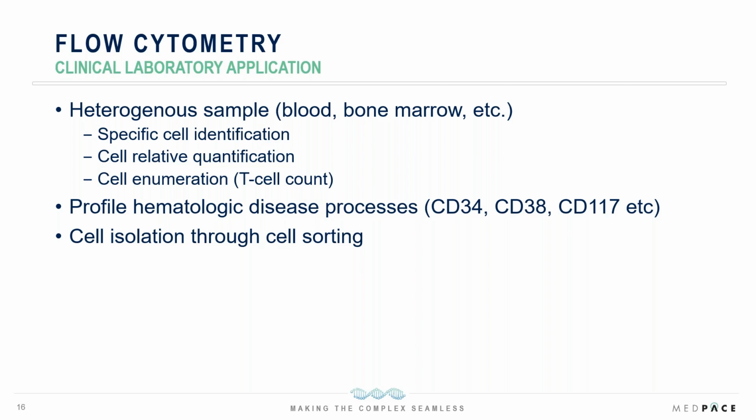And flow cytometry is a technology that has been in the making for some 40 years. In the start, you had one light source, a laser, and you detected 1 to 2 different fluorochromes. Today, there are commercial instruments that have up to 9 laser sources and can profile up to 50 different parameters at any given time. So flow cytometry has developed enormously in the last couple of decades.